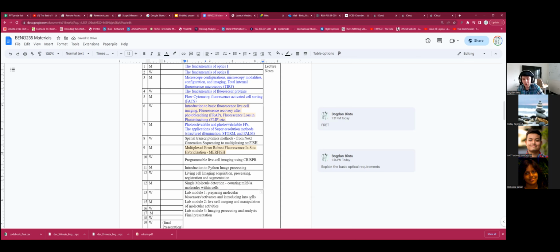All right, so actually, I didn't update this properly, so my apologies. I'm not on the most recent version. But maybe the best is to explain it verbally. This is what I envision, depending on the number of students, but I think no matter how many students, I will be able to accommodate based on groups. I envision booking the 4 microscopes that I currently have in my lab that are capable of doing some of these technologies. So a little bit of this, but mostly focus on this. And then use those to first image a few cells before applying a simplified version of this particular method, and then imaging them afterwards and integrating the information.